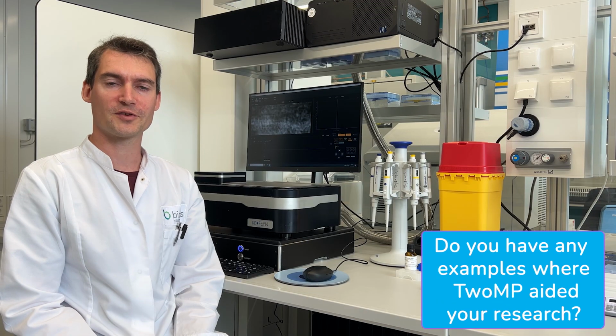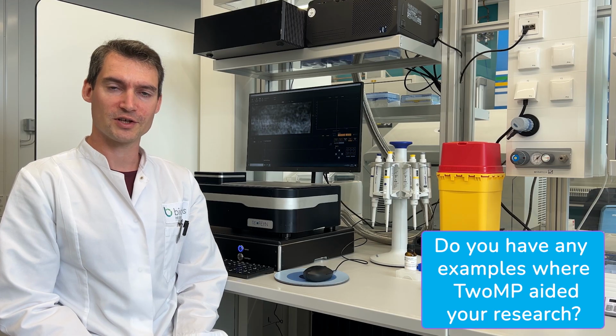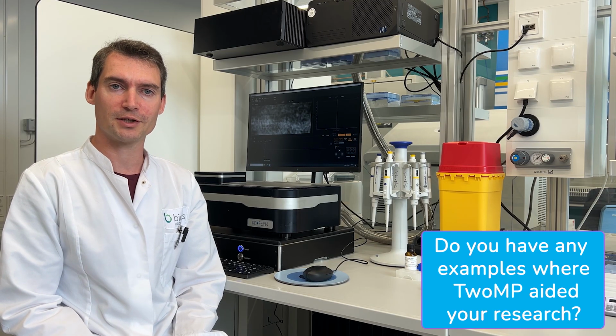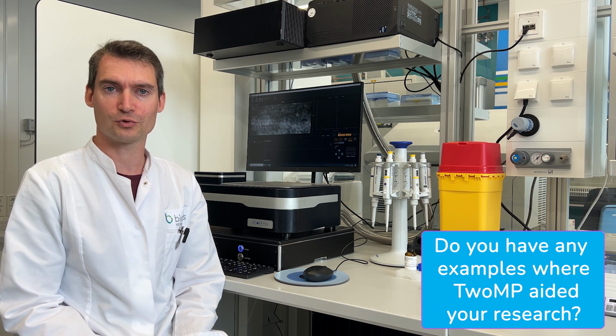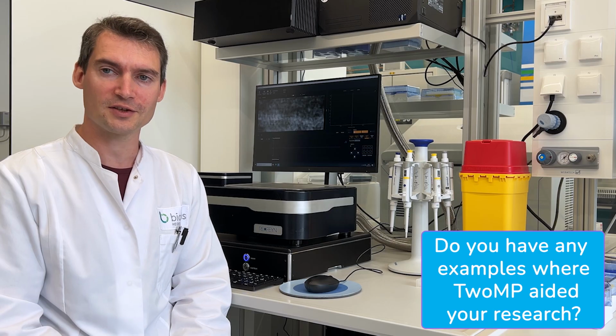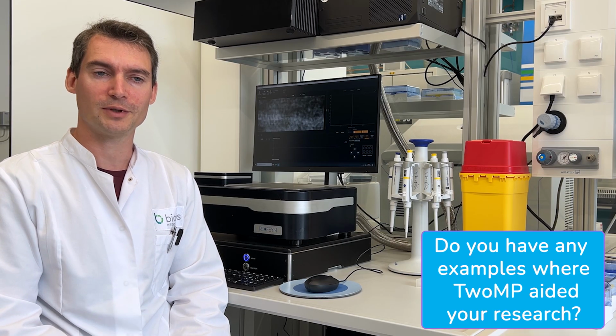There is one specific example I had here in our lab. This was a complexation experiment, and I already used the TwoMP to get a rough idea on the binding ratios to put on the size exclusion column, and the column resulted in 2 separate peaks. What I did was to run both of these peaks again through the Mass Photometer, and as expected, the complex peak was homogeneous and fine to use.